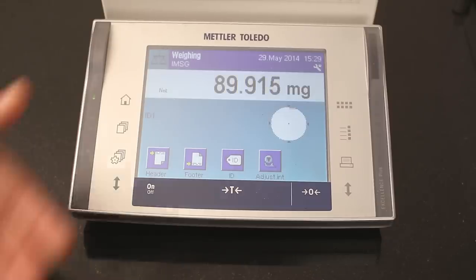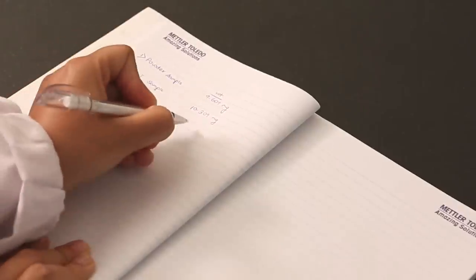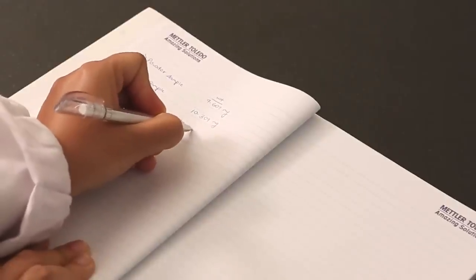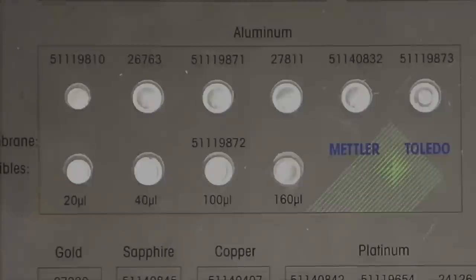Write down the weight in the laboratory journal. Such a correctly crimped crucible should withstand a temperature of up to 120 degrees Celsius when heated at 10 Kelvin per minute.